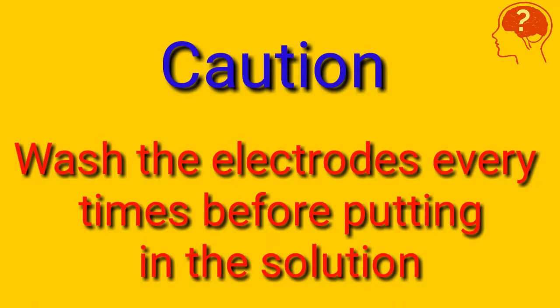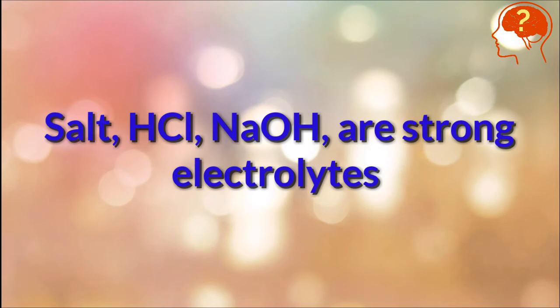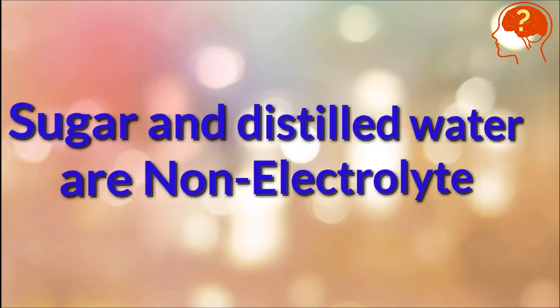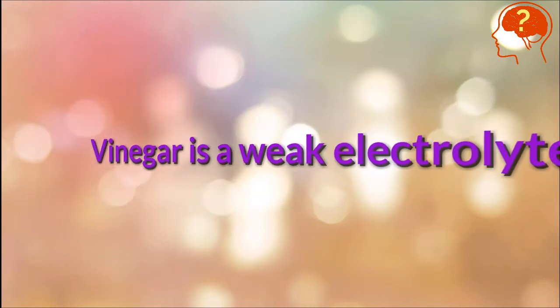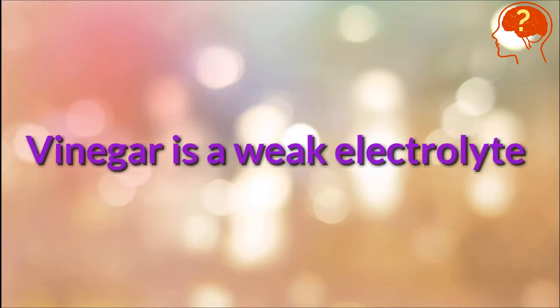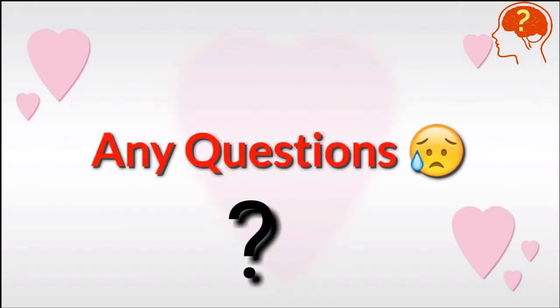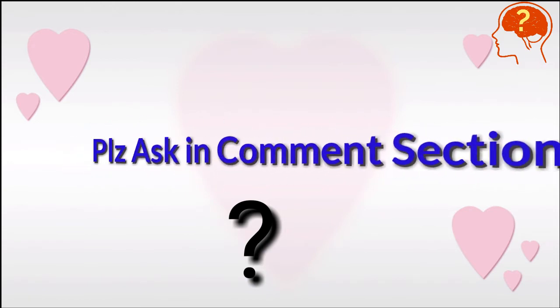Don't forget to wash the electrodes every time before putting them into the next solution. Results of the experiment show that salt, HCl, and sodium hydroxide are strong electrolytes, while sugar and water are non-electrolytes, and vinegar is a weak electrolyte because it produces less glow.